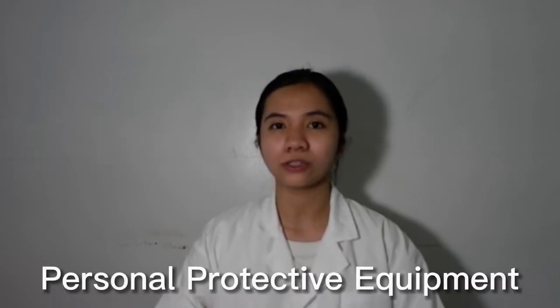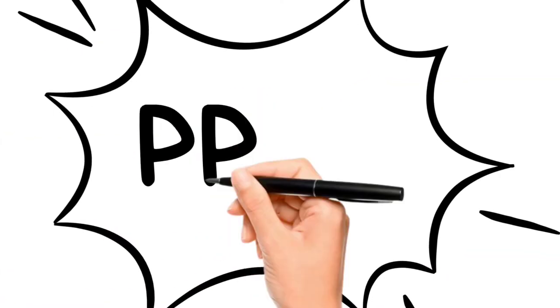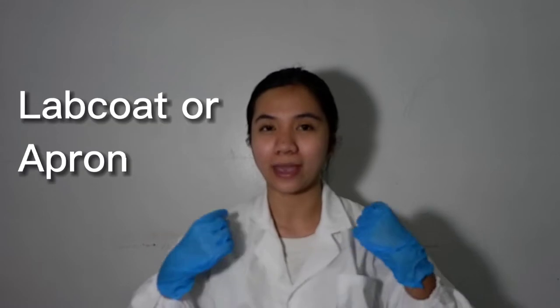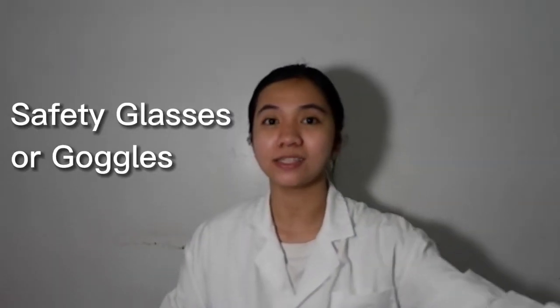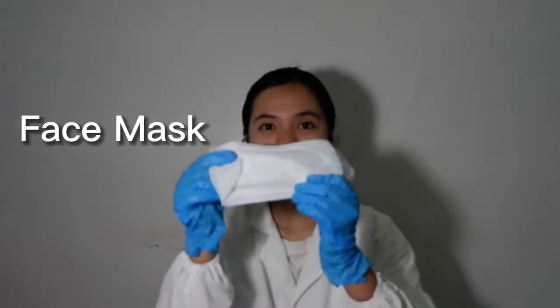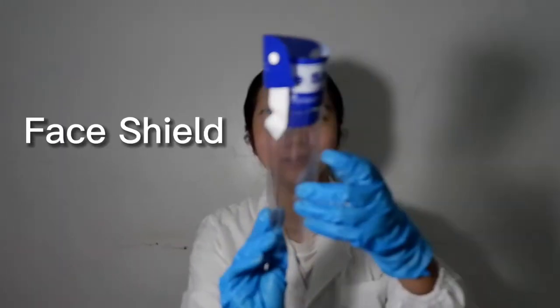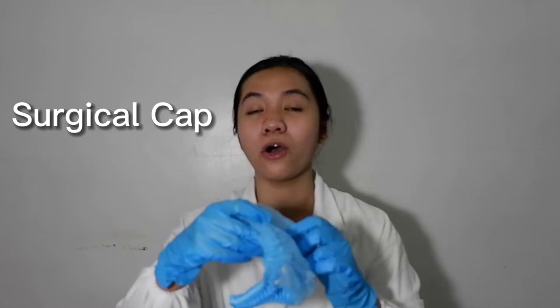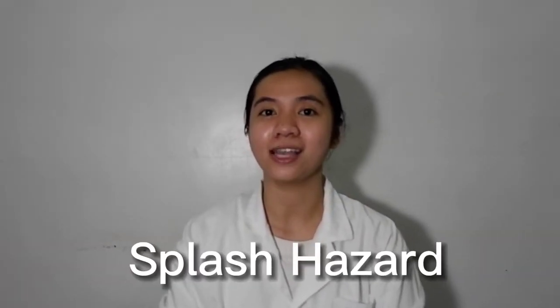Wearing personal protective equipment, or PPE, is one way to prevent serious and fatal injuries in the lab. This includes lab coat or apron, surgical gloves, safety glasses or goggles, face mask, face shield, and surgical caps. These are all optional, but also important for possible splash hazards.